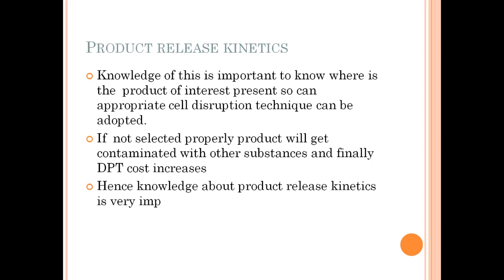Because in case you're not doing this release kinetics, just imagine that actually within 10 hours your product might be released. You have not done this study. We know that actually within 10 hours it is released, but you're keeping the flask for 20 hours. So what happens now? The product is released, plus again because of certain conditions, some other products might get released, and that product gets interacted with your product of interest. So there are a lot of contaminations happening in the system. And finally, if you want to get the product which you are interested in, that will increase your DPT steps. Internally, it will increase your DPT cost.